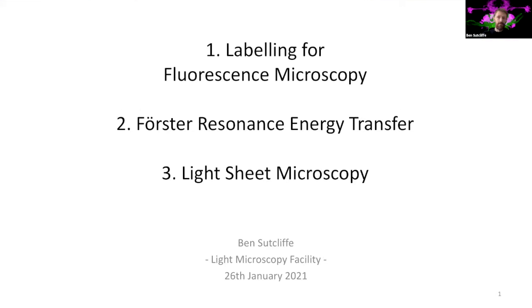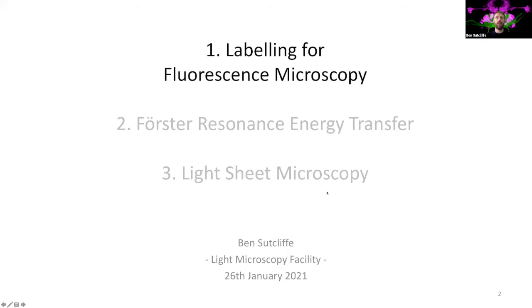Okay, so hello everyone. I'm Ben from the LMB Light Microscopy Facility, and I work with Nick, John, Jerome and James. I'm going to cover three topics today: fluorescent labeling in microscopy, briefly some FRET, and also a bit about light sheet microscopy. So I'll start off with labeling for fluorescence microscopy.